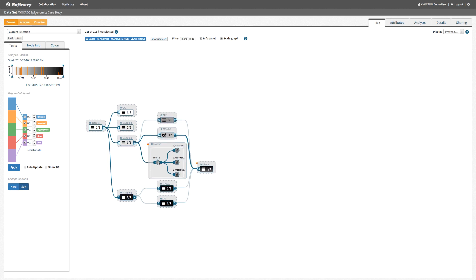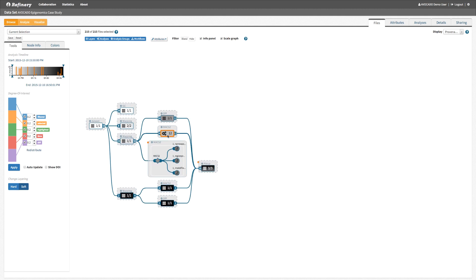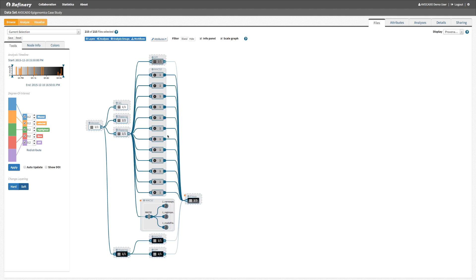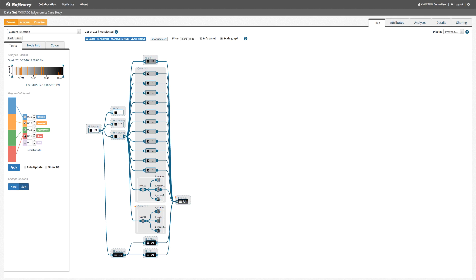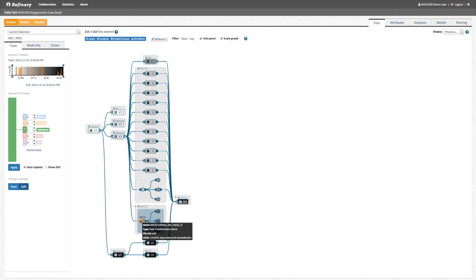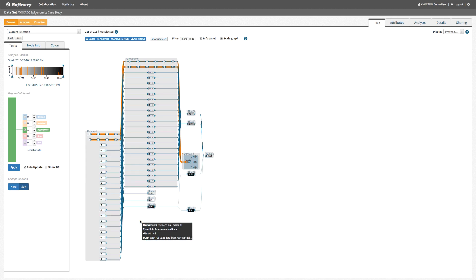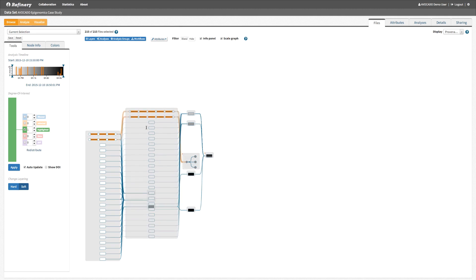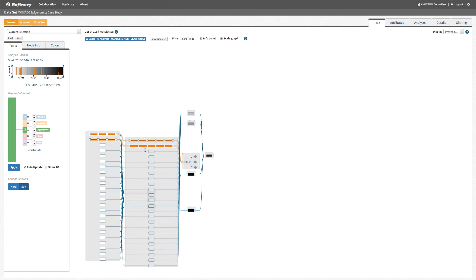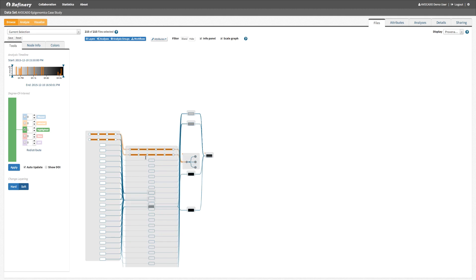We will drill down into this analysis to obtain more information about the workflow. To find out where the inputs for this workflow execution came from, we can modify the degree of interest function to automatically expand any highlighted path to the workflow level. Once we select the inputs for the workflow that we are interested in, their path to the raw data is highlighted and automatically expanded.